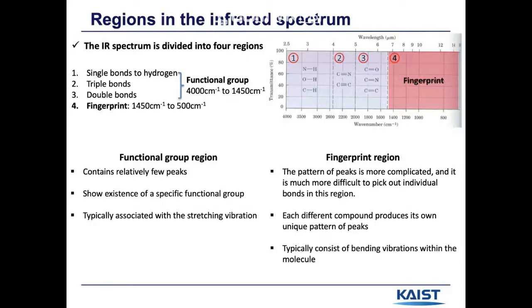FTIR data has two types, transmittance spectra and absorbance spectra. Actually, with FTIR, we only obtain transmittance of the sample with changing wave number. And the absorbance spectrum is calculated with the above relation, or log scale of transmittance. At a glance, you cannot notice the difference between the two data without turning them upside down.